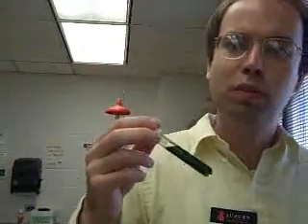So we actually had a problem we had to solve. This is chlorophyll. This is dissolved in petroleum ether. It's in a glass tube. We don't want to know the absorbance of the petroleum ether in the glass tube. We only care about the absorbance of the chlorophyll. So we solved that by using a blank with petroleum ether and glass tube only, so we could zero it out, so that is subtract the absorbance of those two, of the petroleum ether in the glass before we took our readings.